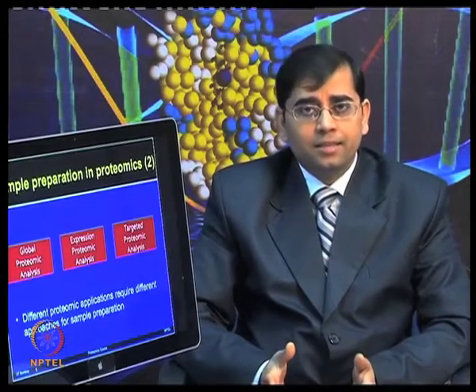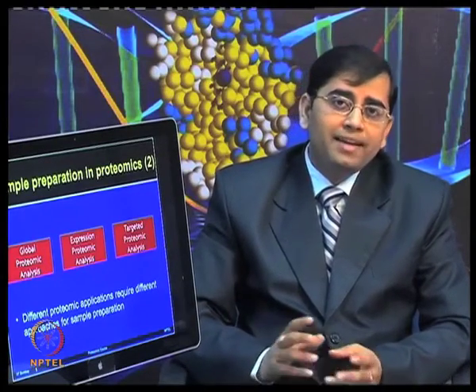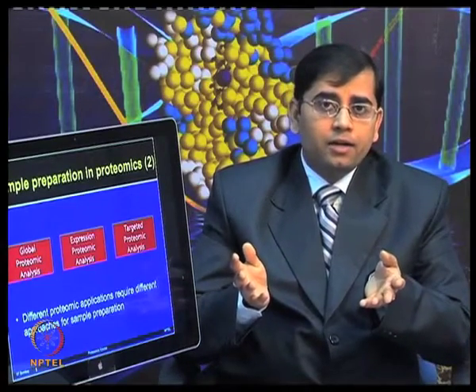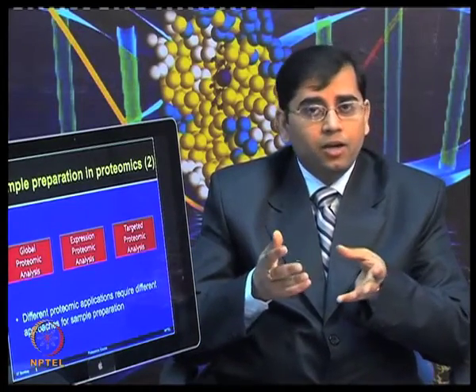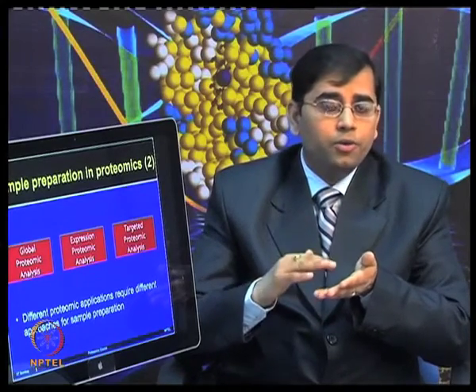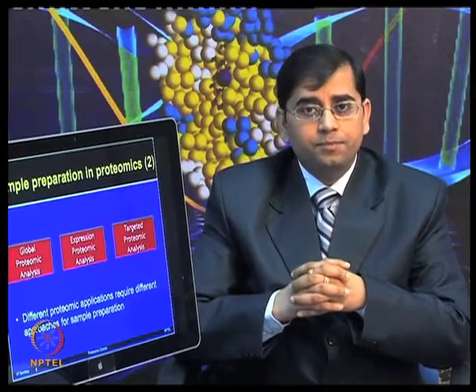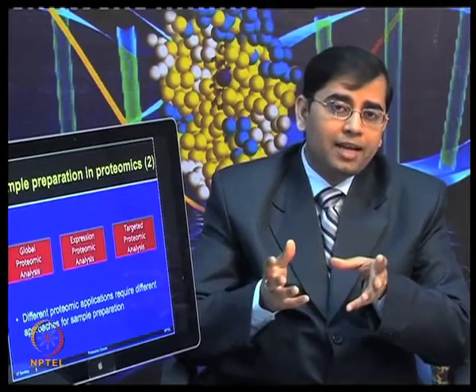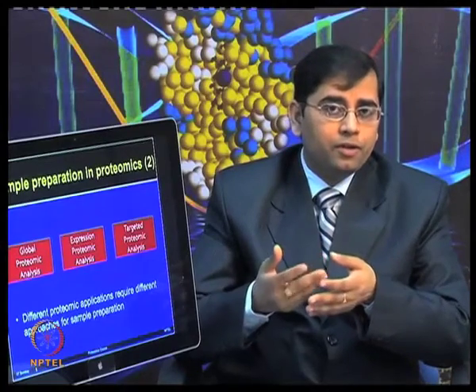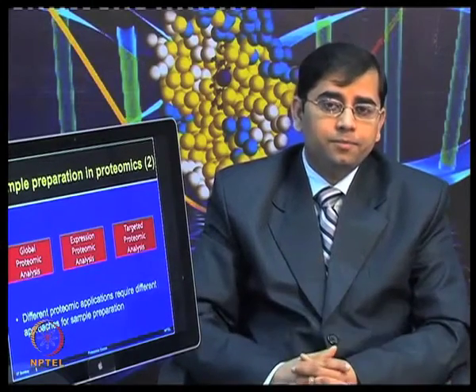Expression proteome analysis means you are mainly interested to look for those changes which are due to any chemical or treatment, where the protein amount is changing, going up or down. So, protein expression analysis is most commonly used for various types of clinical and other studies.